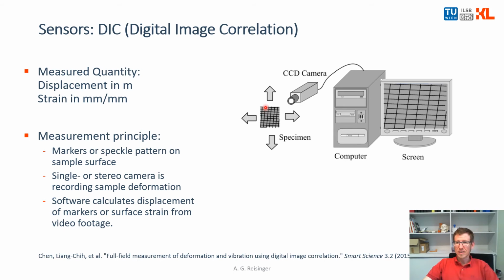These structures can either be markers you glue on the sample surface. I have a sample with markers here.